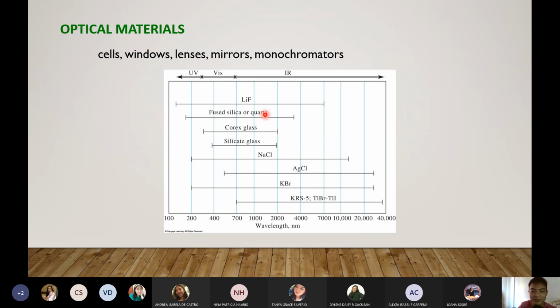Okay. Maliit lang siya pero pag nabasag, super mahal, no? Kaya you really have to be careful with this one. Okay. Pero kailangan yun yung gamitin kasi if you use other materials, light may interact with the particles in the container, no? So magkakaroon ng errors yung inyong measurement.